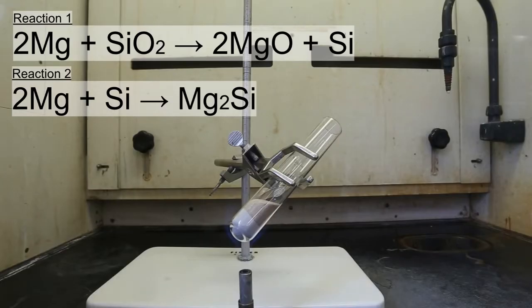In this experiment, there will be two reactions that are taking place, and these are shown above. For the first reaction, the magnesium must be ignited. Because sand was mixed into the magnesium powder, the concentration of silicon dioxide around the magnesium powder is much higher than that of oxygen. When the magnesium burns, instead of taking oxygen from the air, it instead strips the oxygen from the silicon dioxide molecule. This will produce magnesium oxide and silicon metal.